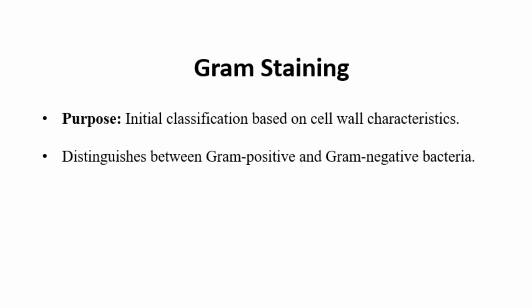And the next point, distinguishing between gram-positive and gram-negative bacteria. In gram staining, we will know whether the bacteria is gram-positive or gram-negative.